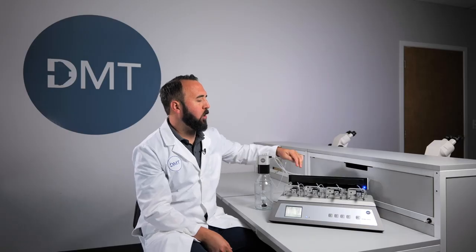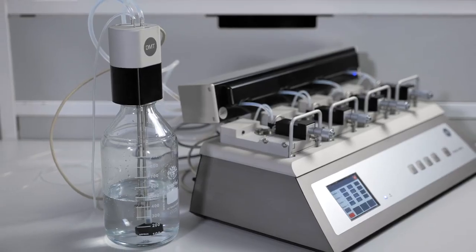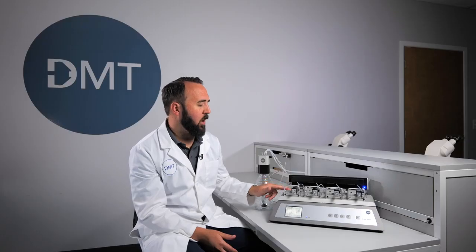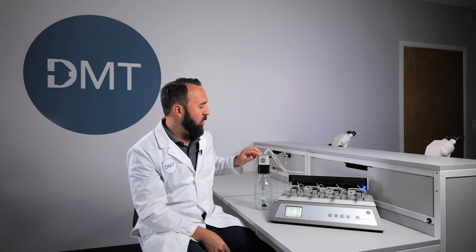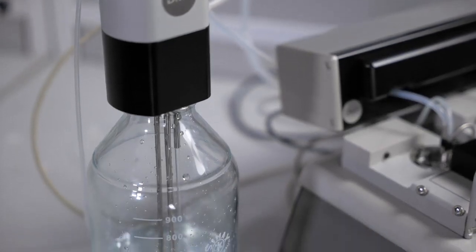The buffer filler will constantly recirculate buffer through the filler back into the buffer reservoir. This ensures that any buffer that enters your chamber will be fresh and warmed while also being bubbled to the right pH. The motor has been moved to be on top of the buffer reservoir. This ensures that any noise from the motor does not impact the readings from the force transducers.